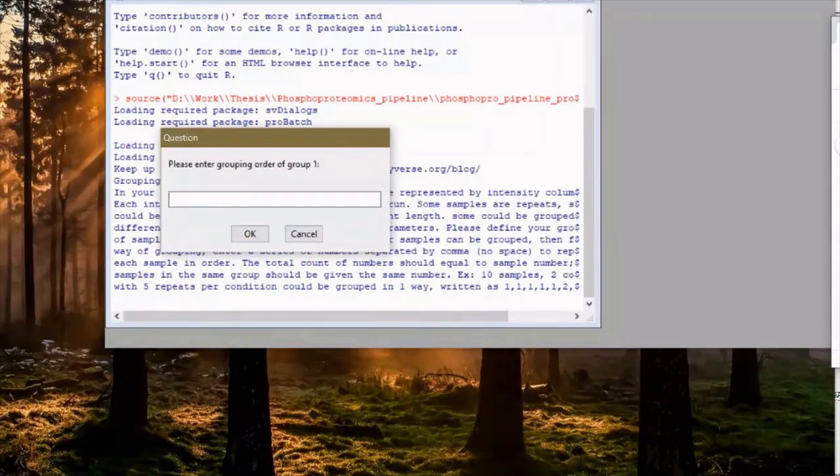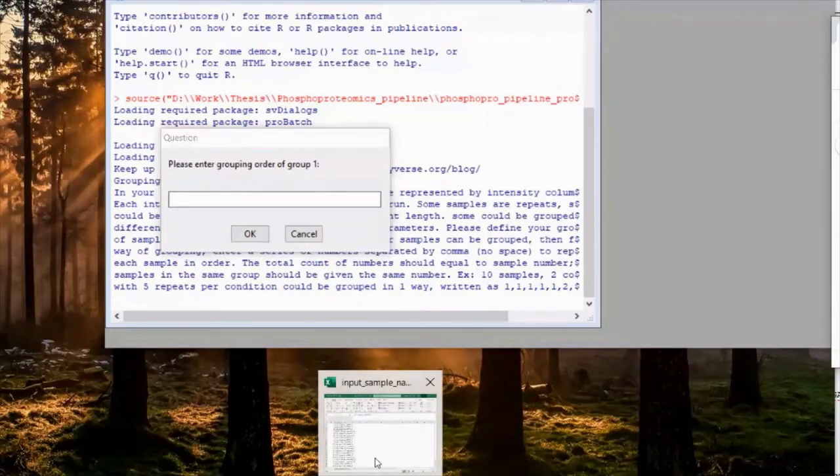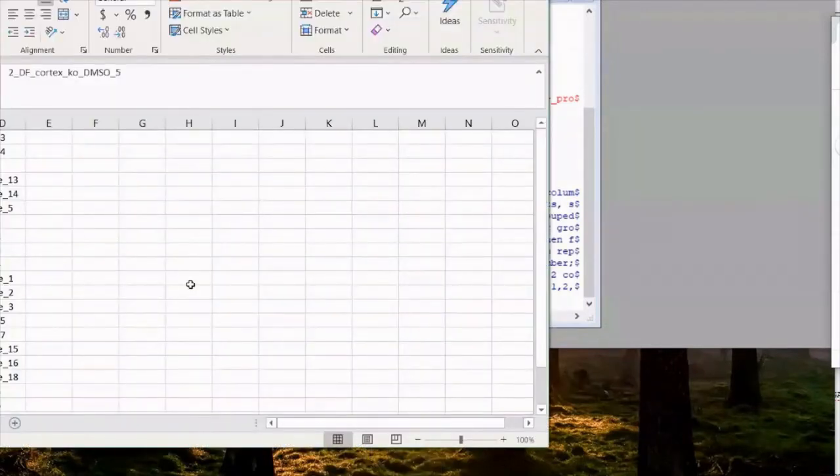One thing to note is that for the fold change, I set it up to have the higher number dividing the lower number. So that would be the order. Usually I think it's KO divided by wild type, which is easiest to see the change, and also treatment compared to no treatment.